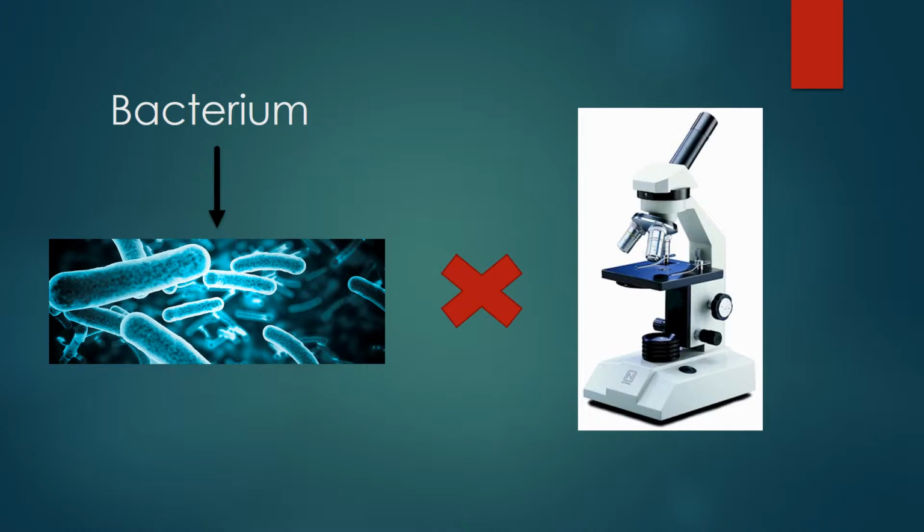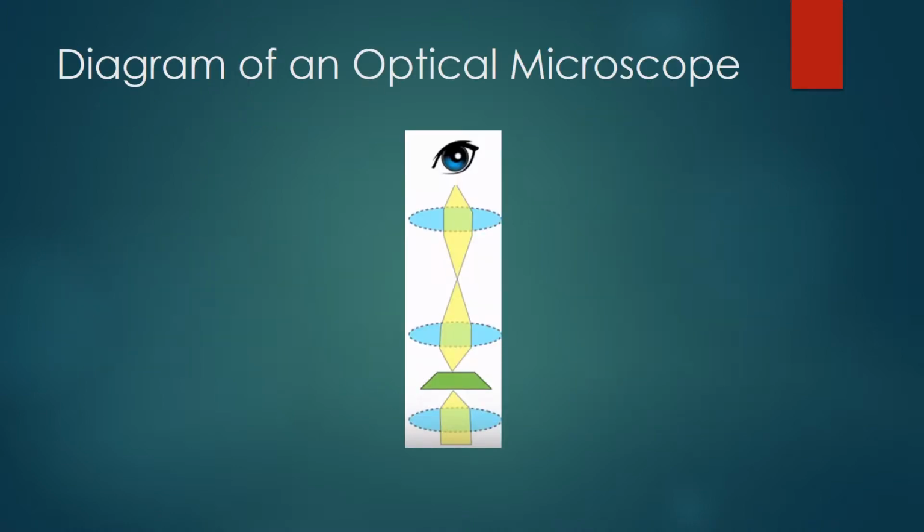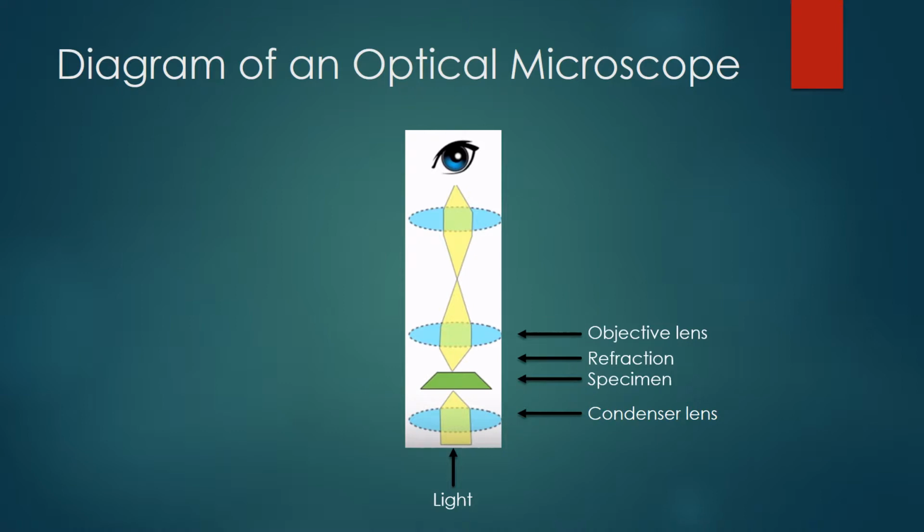They were right. The way an optical microscope works is a beam of light comes from below the object, goes through a very thin, transparent condenser lens, then through the specimen, through an objective lens, refracts again, then through an eyepiece lens, and finally into the focus of your eye. The beam of light is focused using very thin glass lenses, but it relies on the beam of light being capable of passing through the object, which means that the object must be extremely thin and transparent.